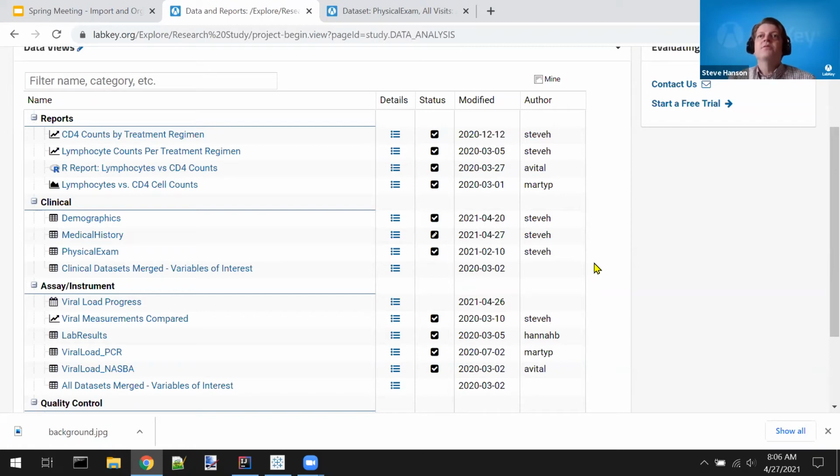Or you could also import it as an assay design. And if you do it that way, we provide a way for you to move those assay designs into a study or into multiple studies. So I think you've got options there. Whether you import it directly as a data set or you import it the long way as an assay, it's really up to you. It's really what you need. Both have their trade-offs.